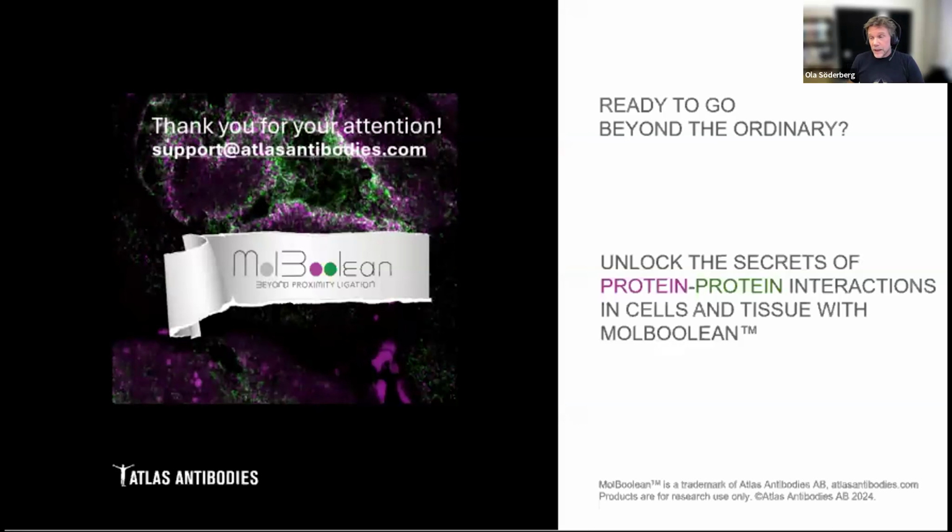and the fraction that are interacting. Then of course, it's an antibody-based method, so it's not a definite value that you get. You will never detect all the different proteins with an antibody-based method. You will see a fraction of protein A, a fraction of protein B, and then you see for these fractions how big a part is involved in an interaction. Okay, thank you, Ola. Moving on to the next question then.